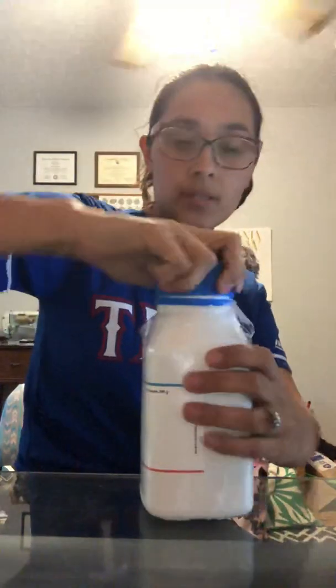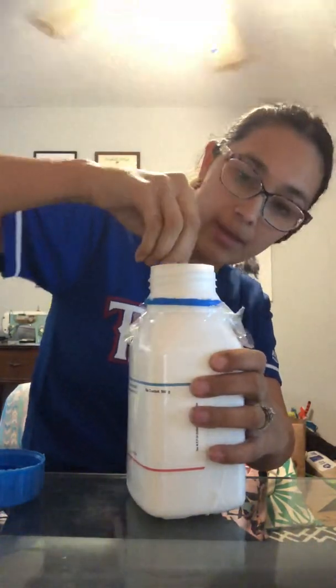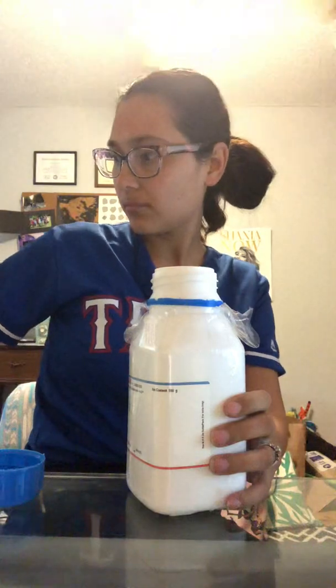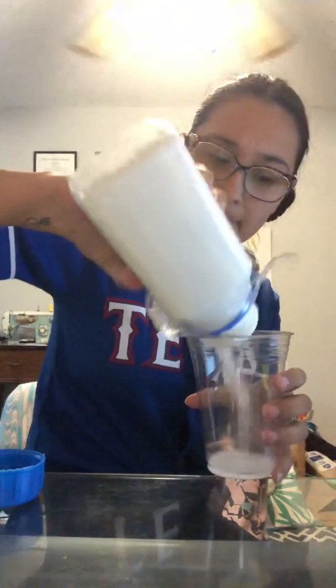Okay, so the next one we're going to do is magnesium sulfate. This is the second row, and you're going to be under physical properties because we're going to look at what this looks like. Okay.